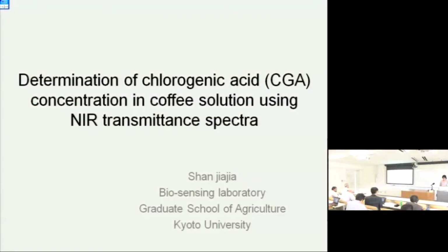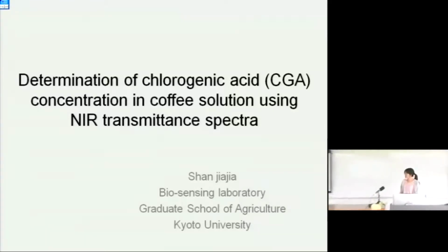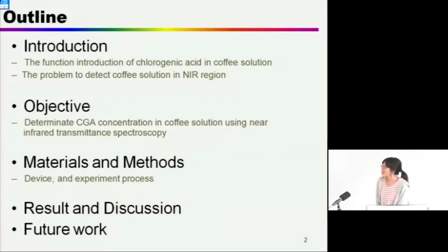Good morning, everyone. Today I will introduce my research: determination of chlorogenic acid concentration in coffee solution using NIR transmittance spectrum. The outline of my presentation today includes 5 parts.